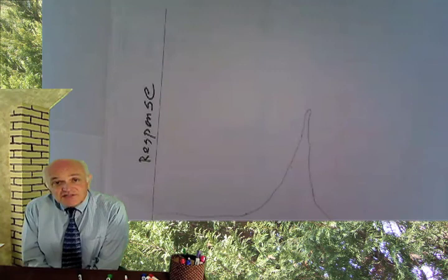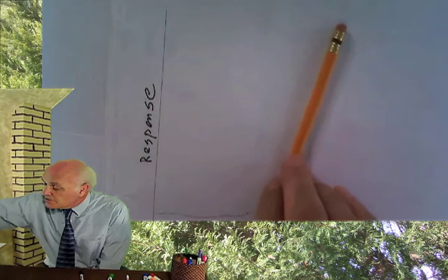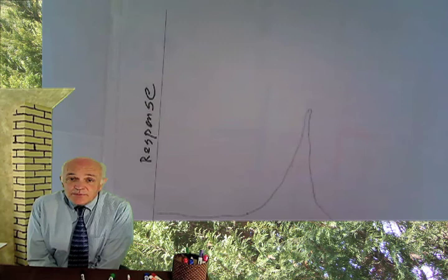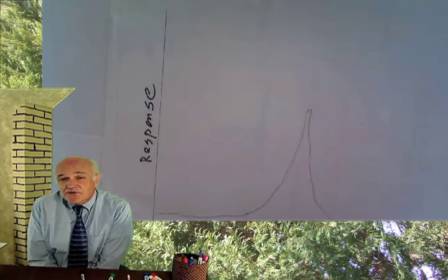So the idea of the computer is to take these numbers and group them in some fashion and look at the slopes. What is the slope doing? Well, the slope's going up. Slope's going up, but kind of slowing down. The slope's going from a positive slope to zero and then to a negative slope, et cetera. It's not too hard to figure out that this is possible. Take the signal, make it into numbers. The computer people write software to help us sort through all this.